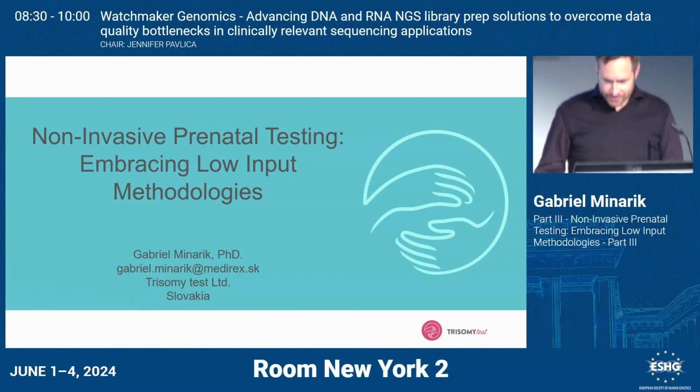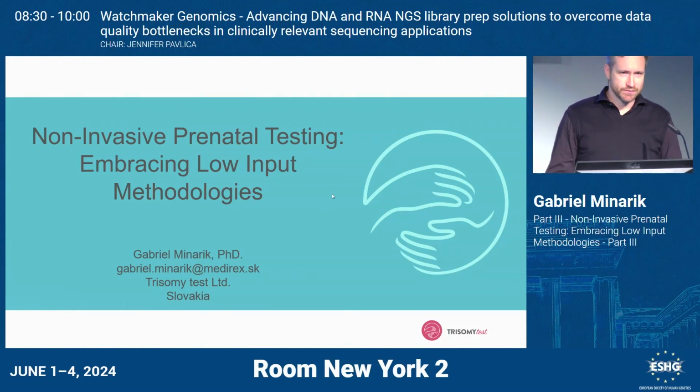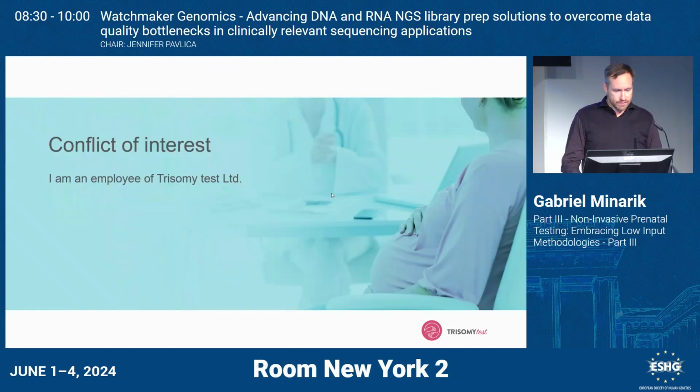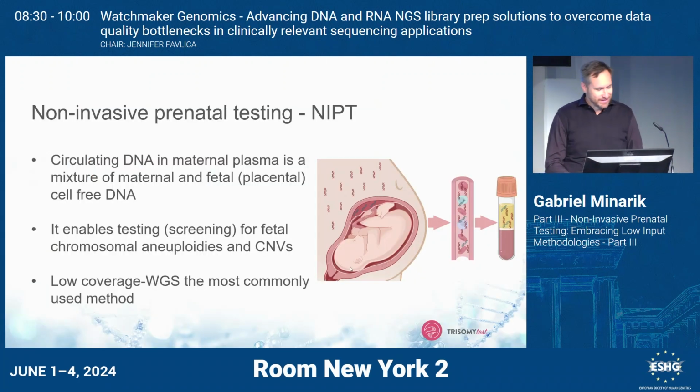Good morning to everybody. I would like to start with some information or data that we gained from the validation or verification of the implementation of the Watchmaker DNA library prep genomic kit from Watchmaker Genomics. I have somehow conflict of interest because I'm an employee of the private company that is doing NIPT, but no conflict of interest regarding Watchmaker Genomics.